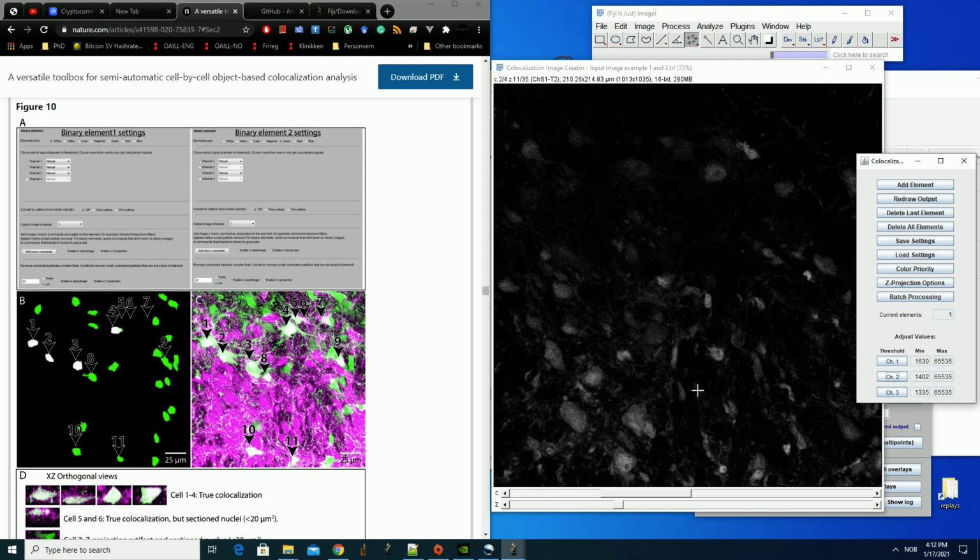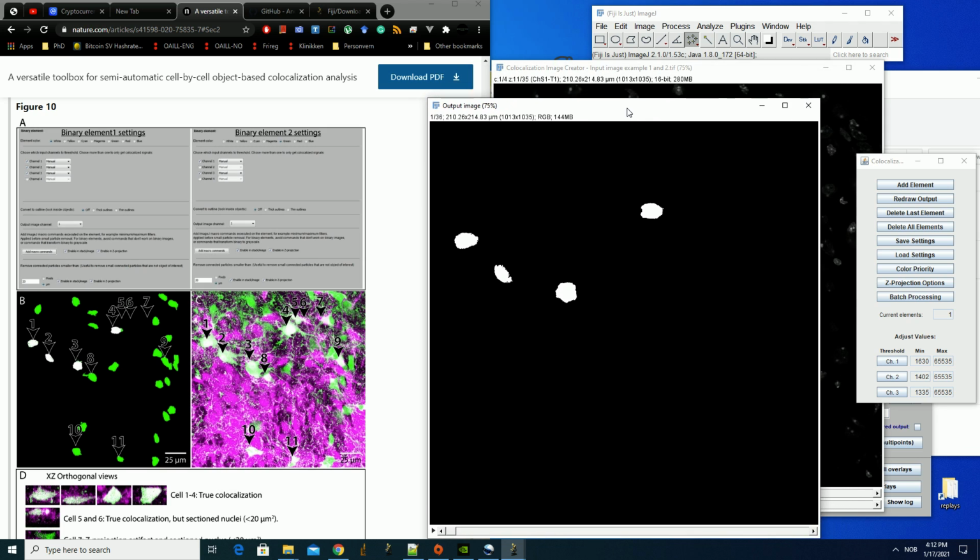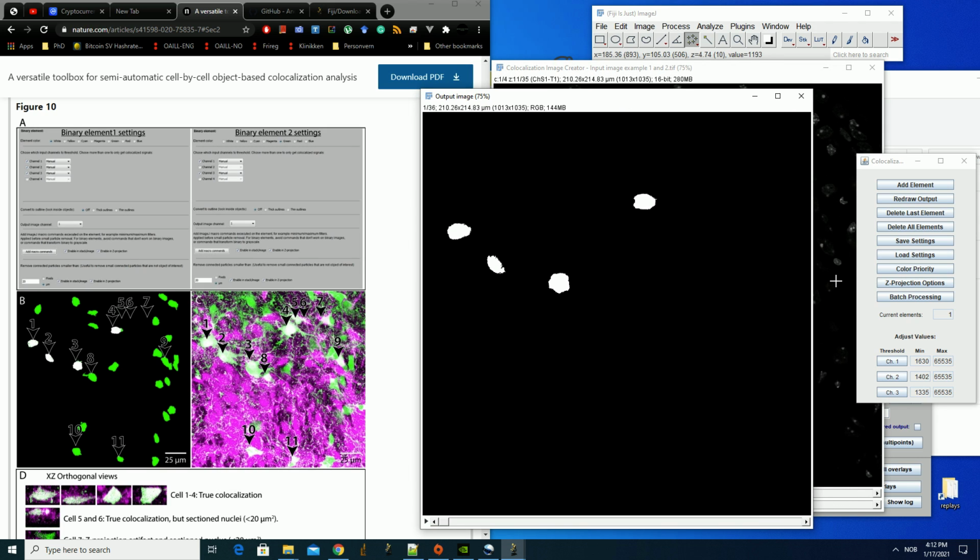So basically, this setting of the threshold is of course very critical, and you have to set a threshold yourself or do a binarization step that you believe is representative of your actual signal output, and you should always verify that this signal actually represents the true original staining.